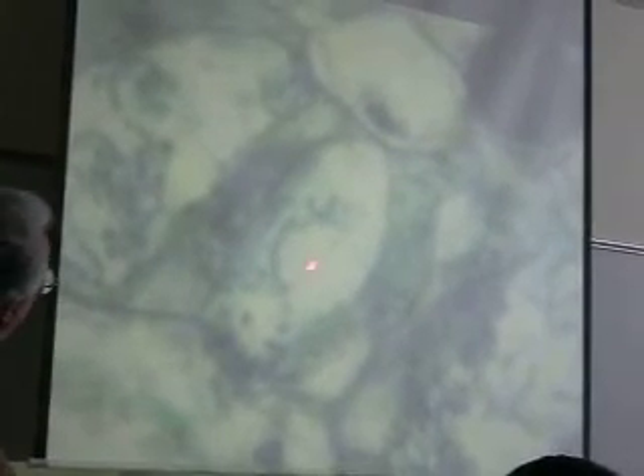The cycads: the first slide is a cross section through a root. We don't do anatomy until Friday, but this is the interesting stuff. It's the tubercells — the little round green things are either Anabaena or Nostoc, a blue-green algae that lives in there.